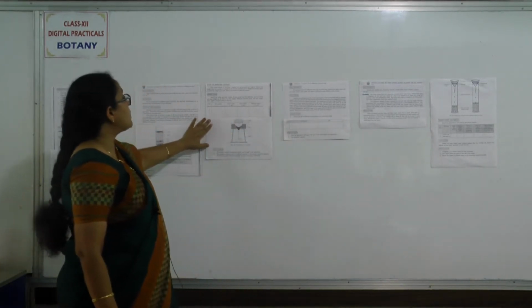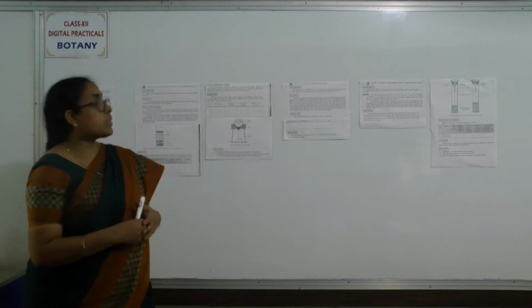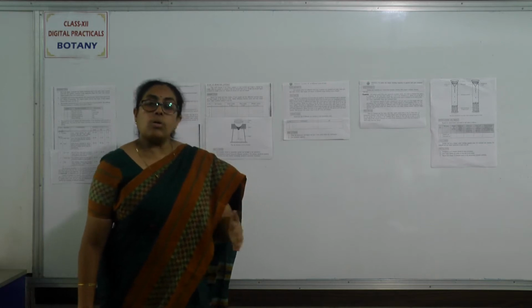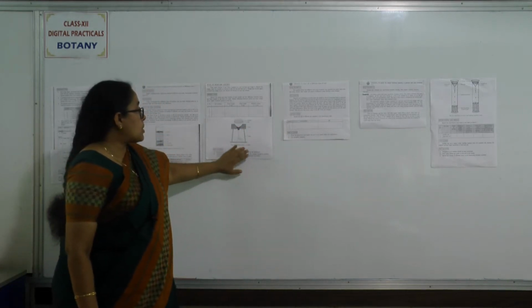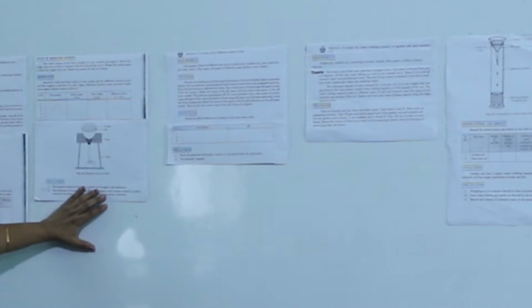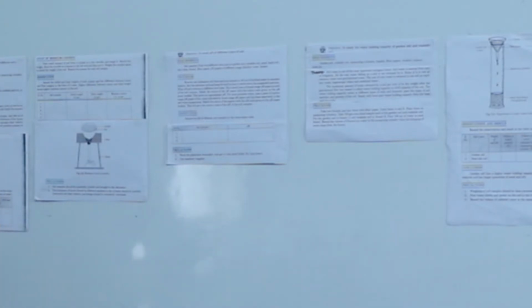The third one given here is the moisture content. As we know, moisture is one of the most important contents of the soil, which helps in determining what type of plant can grow on it. To know the moisture content, we have used this method which will be explained to you. It will give us an idea of what water moisture content remains in the soil, and that also helps in determining how we can grow different types of crops or vegetation in different places.